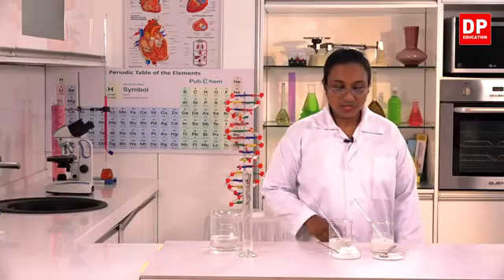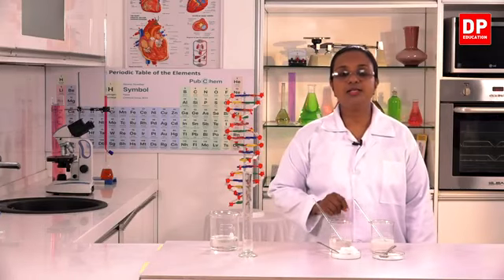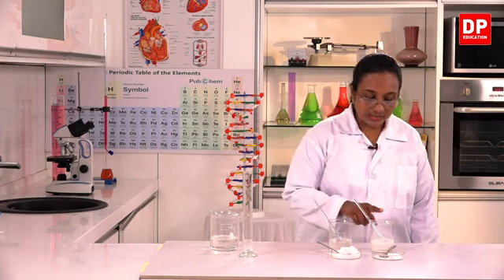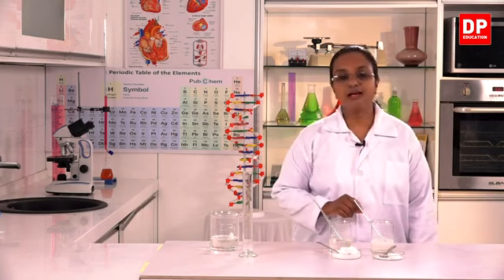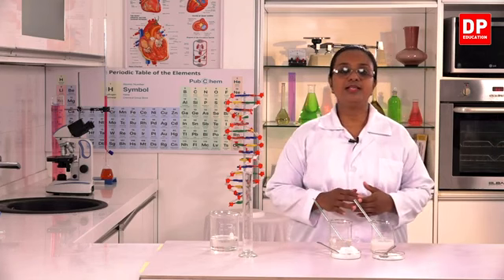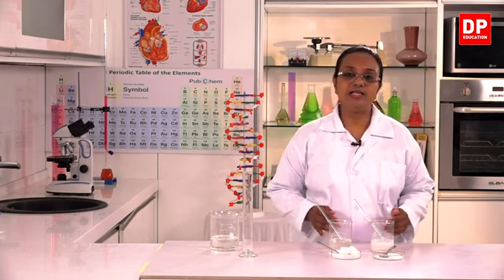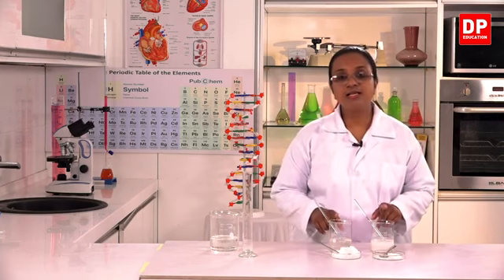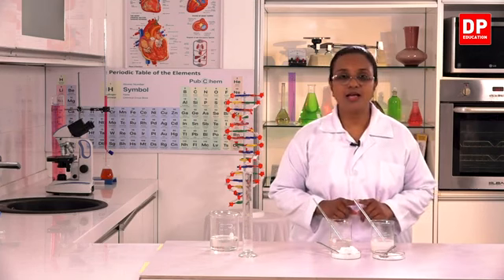So now students, I dissolved 3 teaspoons of salt into this solution and 3 teaspoons of calcium hydroxide into the second beaker. The solvent is the same, water, volumes are the same, 100 milliliters of water, but the solutes are different, sodium chloride and calcium hydroxide.